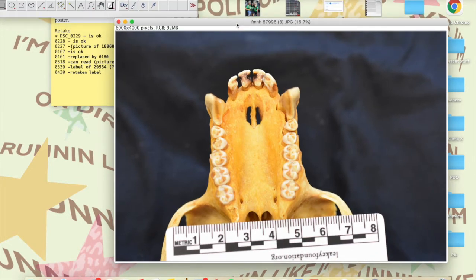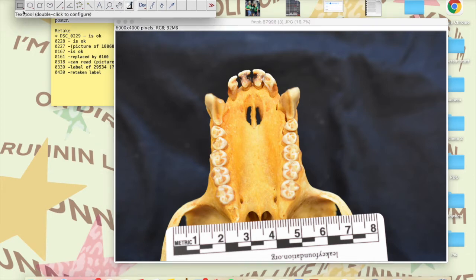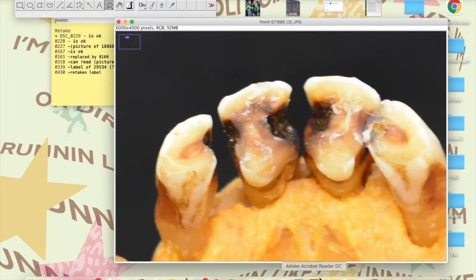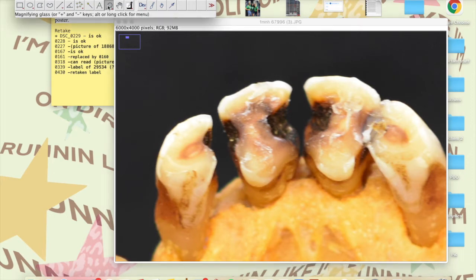There are a few different buttons you can see at the top of the ImageJ bar, and mostly the one that I use is the zoom in function, which is the magnifying glass. You can use it to click and zoom in. It works pretty well. It zooms in on the area that you click, which is the area that you want.